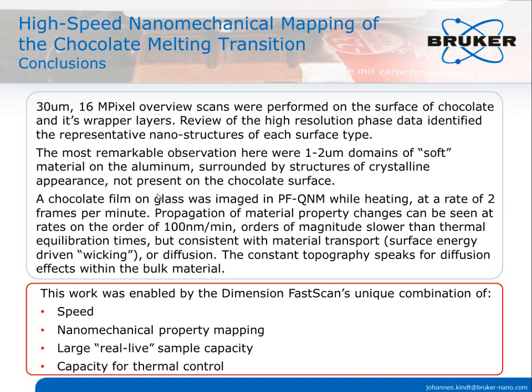This work was enabled by the Dimension FastScan's unique combination of speed, nanomechanical property mapping, large real-life sample capacity, and capacity for thermal control. We hope that you will enjoy some good chocolate FastScan demos with your customers, including all the beneficial side effects discussed by Bruinsma and Taran.